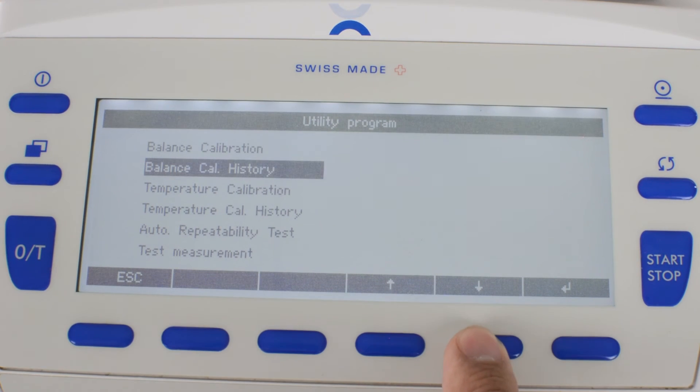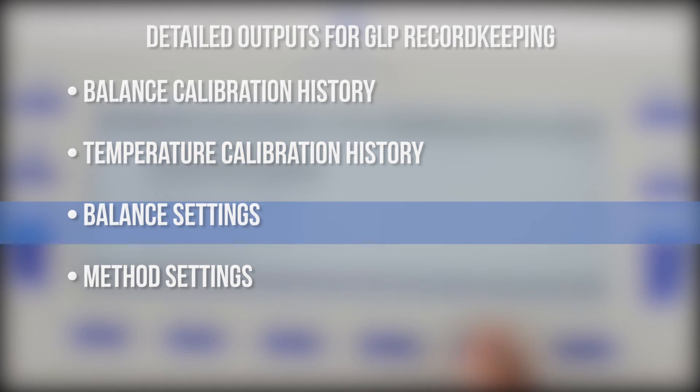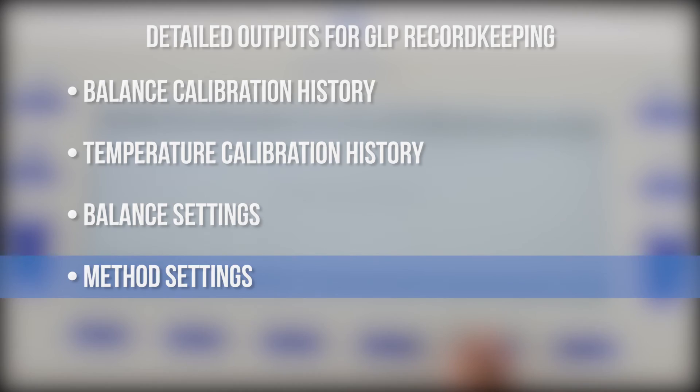Additionally, for GLP compliance, the balance can output balance calibration history, temperature calibration history, balance settings, and method settings for record keeping.